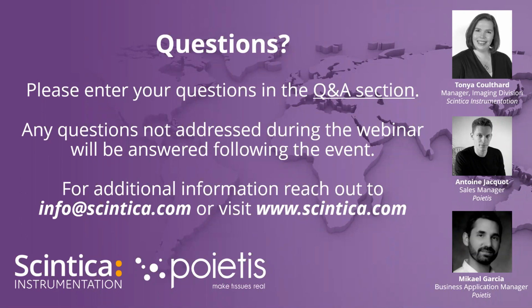Perfect. Excellent. A couple of questions to do with the hood and it being closed. I'll take a stab at the first one. Does the hood have to be closed when doing printing? What you didn't see, or perhaps you did, is that there is actually a film on that hood, which prevents any stray laser light from coming out. And so it would need to be closed for any of the laser assisted bioprinting steps. Antoine or Mikhail, what I'm not sure of is if you can operate the system with it open and only use the extrusion or the inkjet heads.